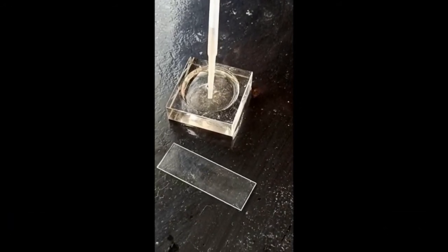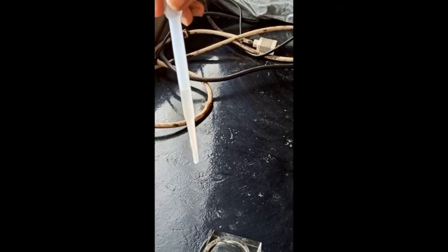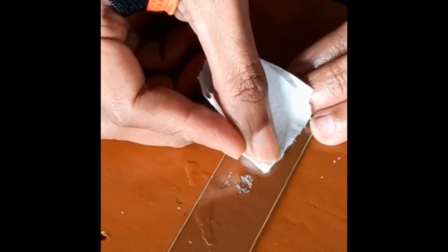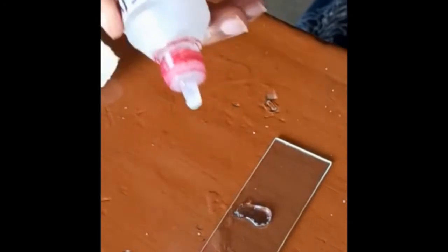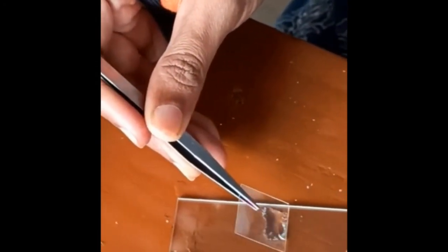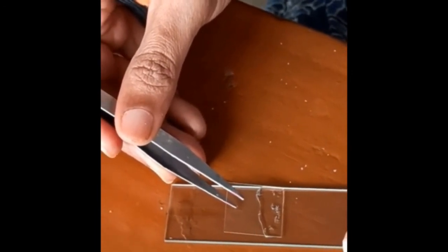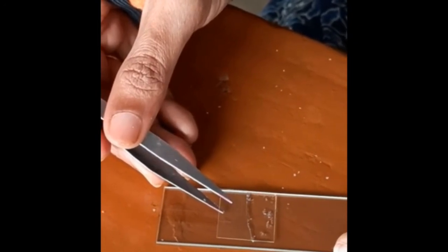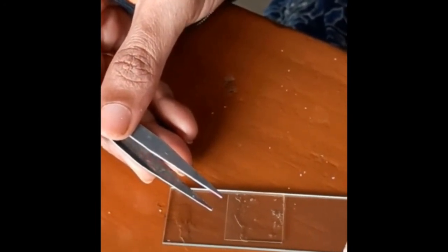For mounting we have to collect these placoid scales with the help of a dropper. Then again we have to hold the dropper in inverted position so that maximum scales will gather in the lower drop, and then we will place the first drop on the slide so that maximum scales will come on the slide. Then we have to blot excess water, add 1 to 2 drops of glycerol, and then place the cover slip on it. Whilst placing the cover slip we should be extra careful because placoid scales are very delicate and brittle, and due to the pressure of the cover slip they may break. So we have to place the cover slip gently.